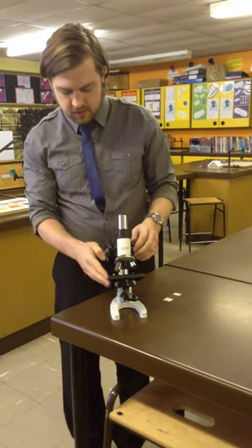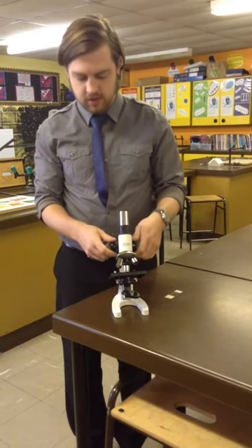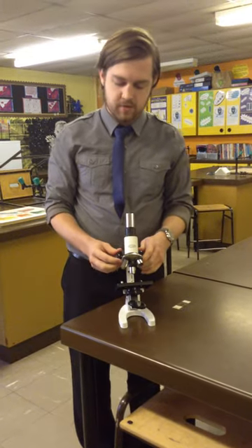Next thing you need to make sure you do, the stage needs to be at its absolute lowest. So use the turning knobs to make the stage go all the way down to the bottom so it's as far away from the lens as possible.